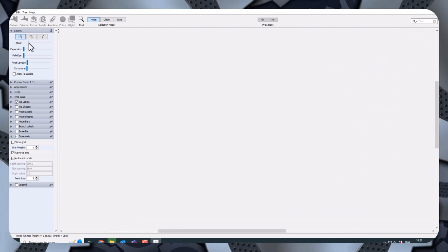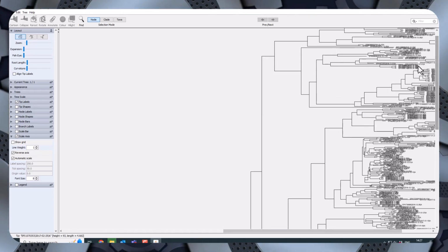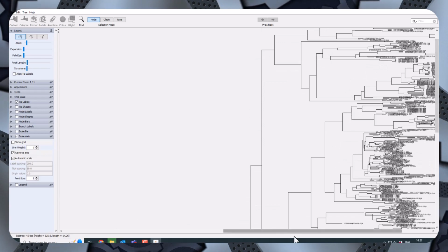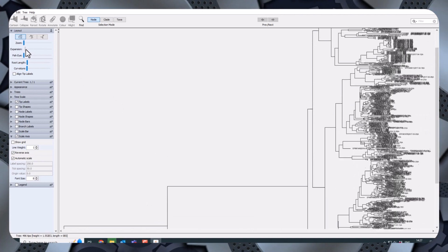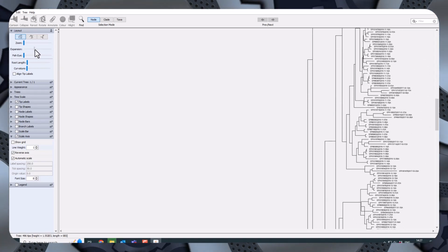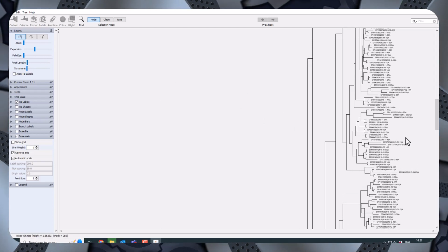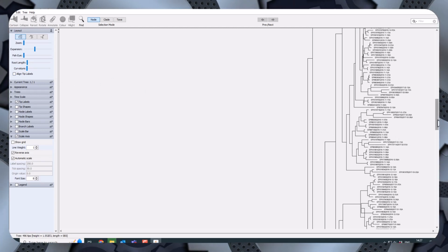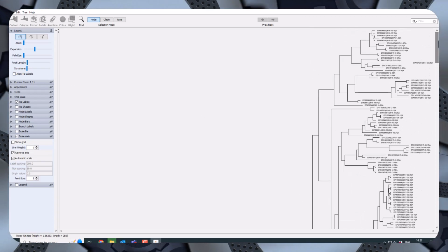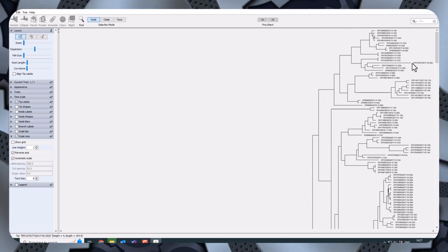So I can see different groups. Now the length you've got along these lines is how many days it is. So here is a recent, probably the most recent of the files, which was collected on the 25th of the 5th, 2017. So I have to go back however many days this length is until it's split from the ancestor, which corresponded to the sequence that was collected on the 5th of the 1st, 2017, and the 23rd of the 1st, 2017.